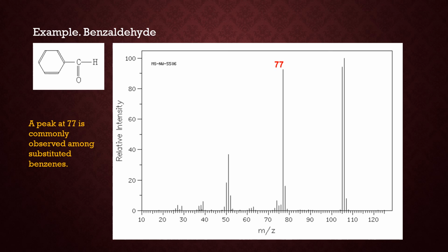There are two signature cases, namely an even value turning up in the fragment, which suggests that you've got an odd number of nitrogens in that fragment. And then there's the characteristic signature of the aromatic ring, in this particular case benzene. There would be another one for, say, naphthalene. But in the case of substituted benzene, you get a characteristic fragment at 77 AMU or m/z 77. So these are things you should be looking out for as you analyze a mass spectrum.